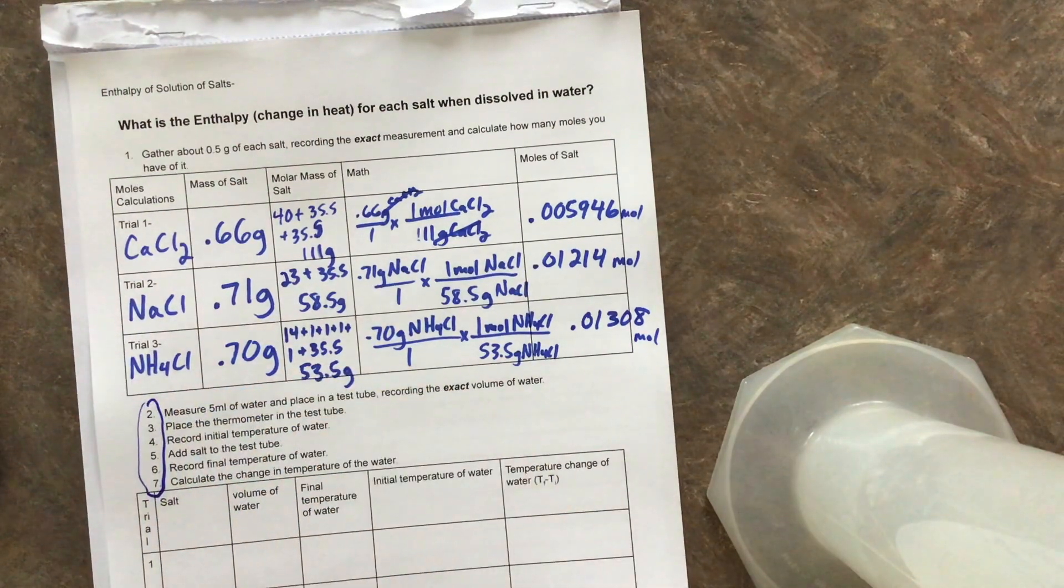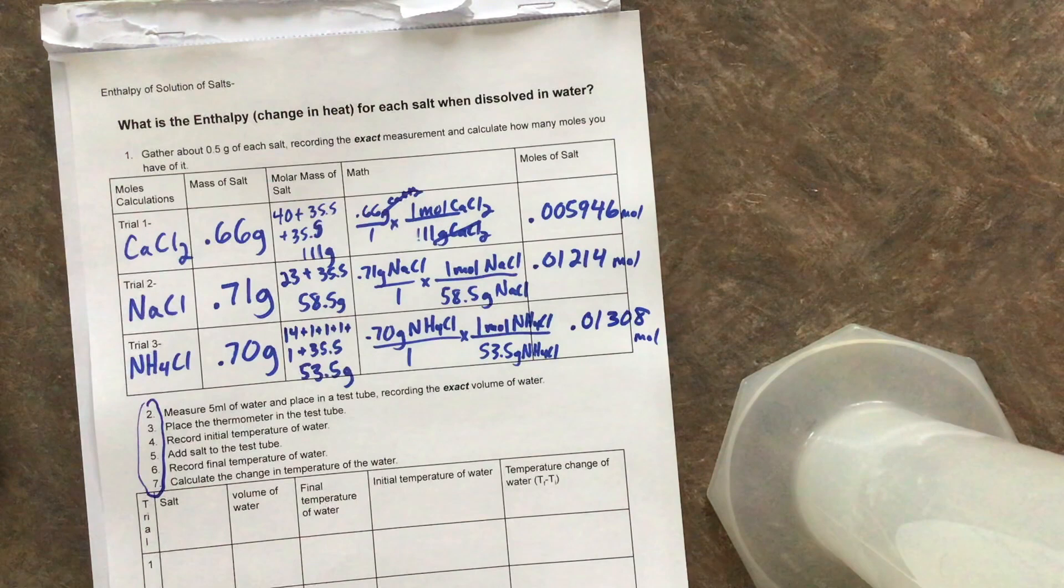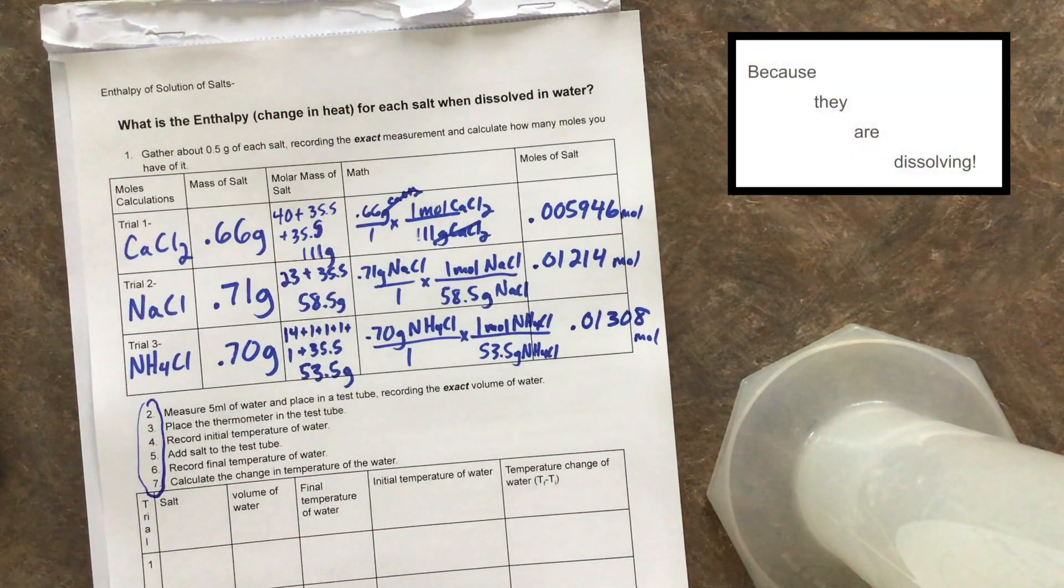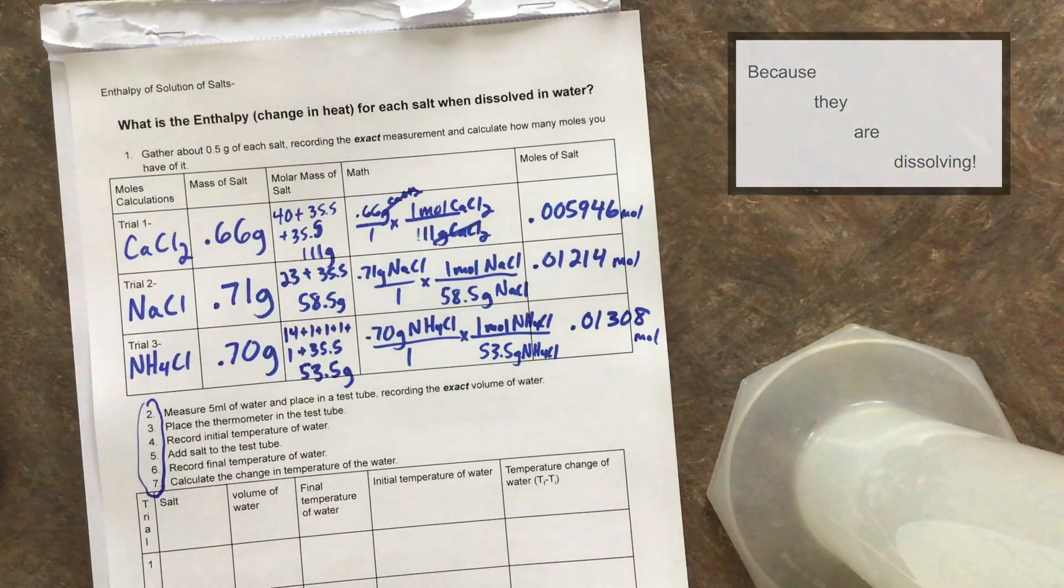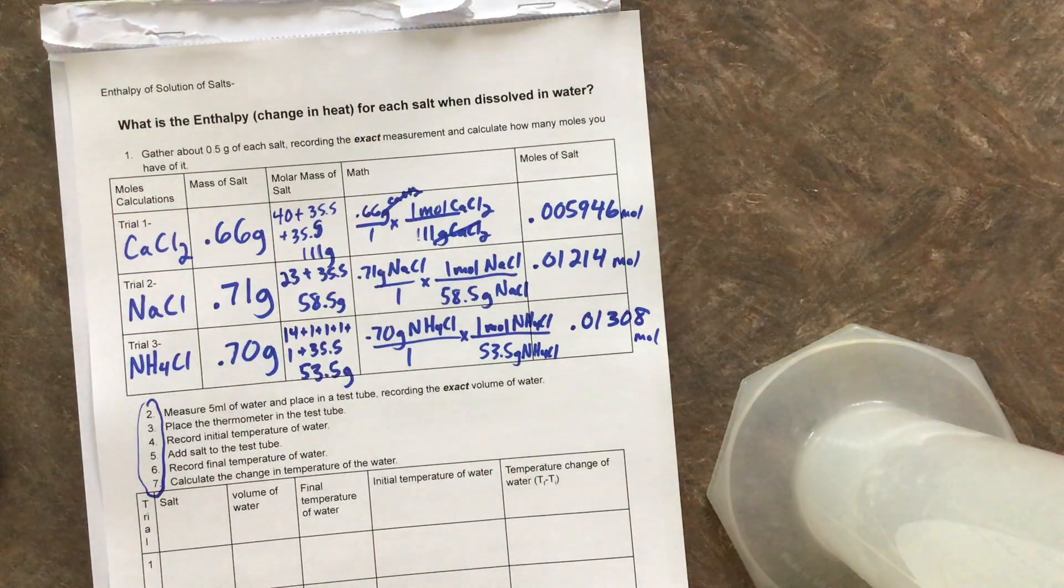We are going to take these salts and dump them into about five milliliters of water. When we do that, the temperature is probably going to go up, go down, or stay the same. And that's the thing, you're like, I didn't even know water changed temperatures when you put salt into it. And it does, it sometimes changes temperature, that's what we're trying to figure out. So let's go on to step two, three, and four.